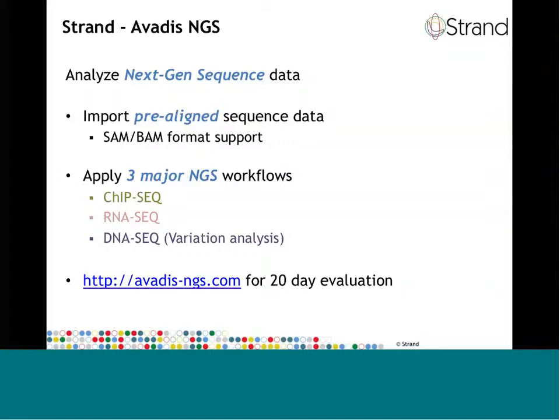For instance, the Illumina version of CASAVA that is due out in February, version 1.8, will adopt the SAM-BAM format as the only exchange format, relegating the export format to the status of internal exchange format only. So for historical data that is not provided in the SAM-BAM format, there are a number of converters available that will quickly and without loss of information convert these data files into SAM-BAM format.